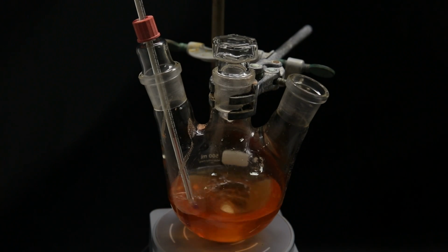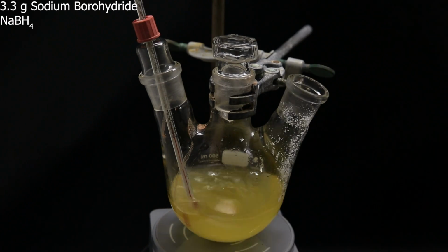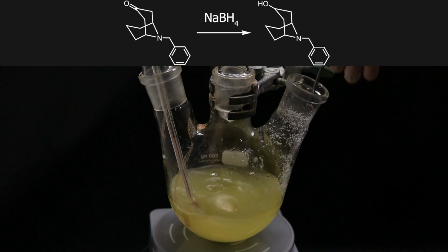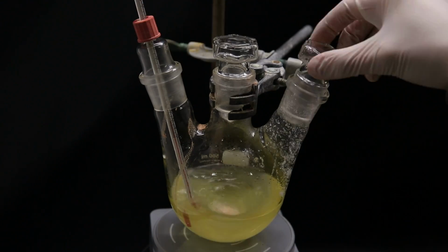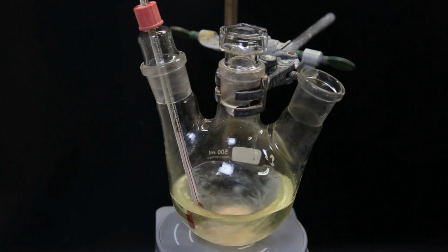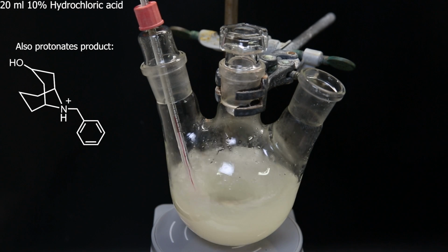I open the right neck and gradually add in 3.3 grams of sodium borohydride, which turns the solution yellow. The sodium borohydride will simply reduce the ketone to an alcohol. I leave it to stir for an hour at room temperature and it has become a clear yellow. Now I quench the reaction by adding 20 ml of 10% hydrochloric acid, which will destroy any remaining sodium borohydride.